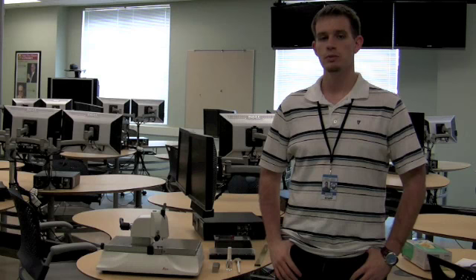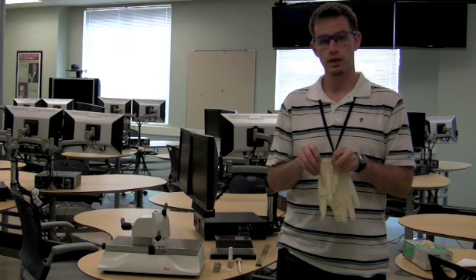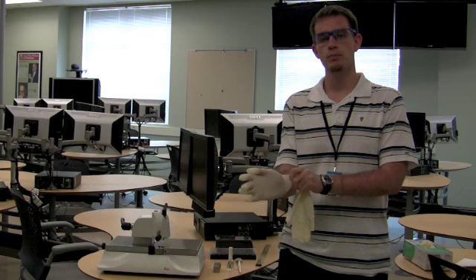It's important to always make sure that we properly protect ourselves. For this instrument, we'll be using protective eyewear. In addition, we'll also be using protective gloves. The reason for these is that the breaking of the glass can cause splinters, which can cut the skin. And in addition, the glass knives that are created have sharp edges, so it's important to make sure that we protect ourselves from being cut by the glass.